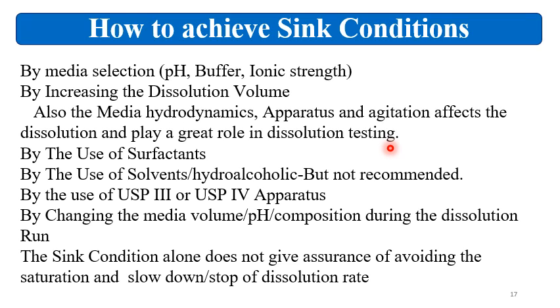If you have a highly soluble drug substance and you have taken 500 ml of media, but the RPM of the paddle apparatus is around 25 RPM, then you may not get the complete release because of the less hydrodynamics. Then we can use the surfactants to increase the solubility, and that's why we can get the sink condition.